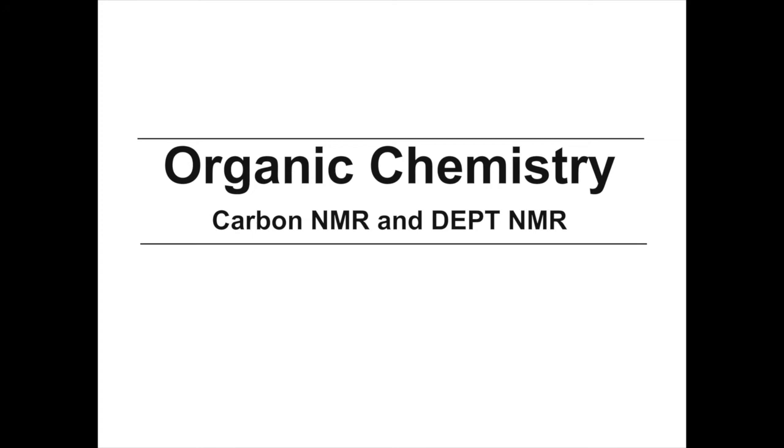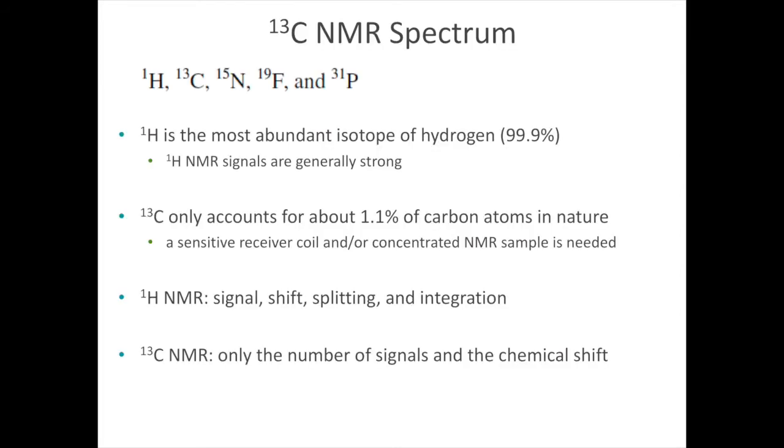In this video, I will be discussing carbon NMR and DEPT NMR. By this time, you would have already learned about proton NMR. Remember, we learned that there is such a thing as a nuclear spin, and atoms that have an odd number of protons and/or an odd number of neutrons in the nucleus will have this quality. So that's why we learned about proton NMR.